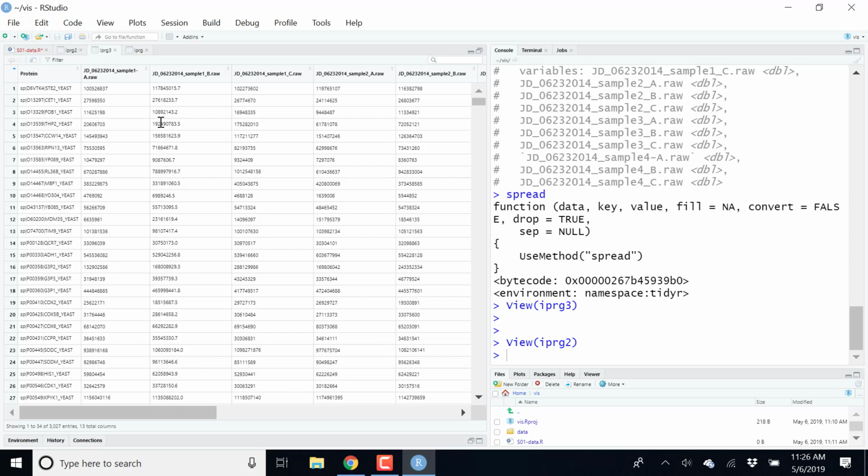We have 2 proteins in 2 samples. For each of these pairs, protein and run, we have an intensity, X1A for protein 1 in sample A. We have here also 4 intensities, but they are re-encoded so that all the proteins are featured along the rows and the samples along the columns. And so these are 2 fundamentally different ways of thinking about the data, and this data structure is really useful for some applications, and this data structure is useful for other applications.